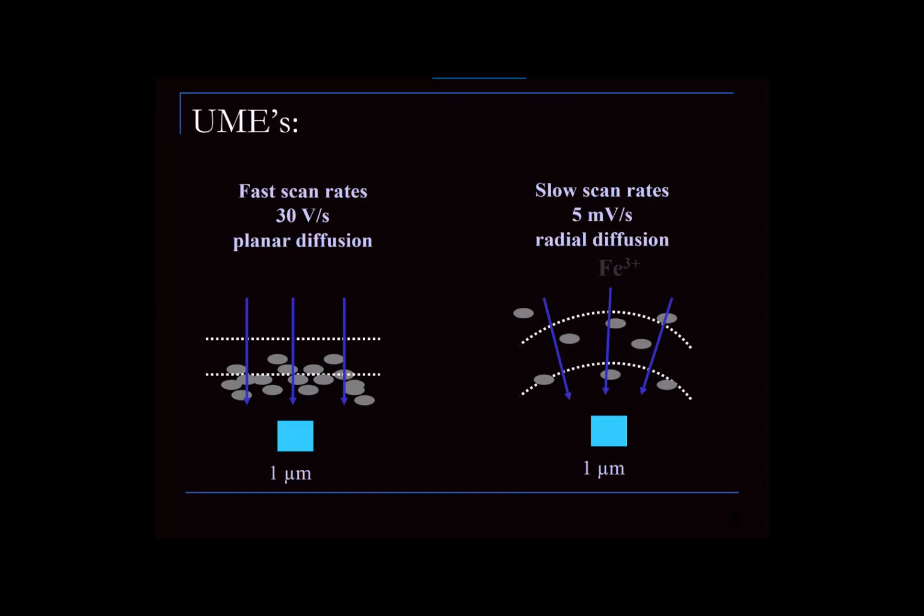So one last thing I want to talk about in regard to voltammetry is this duck, this odd shape of a waveform. It's not the ideal waveform for quantitation, because as you go to lower and lower concentrations, it's going to be harder and harder to measure the peak current relative to the background.